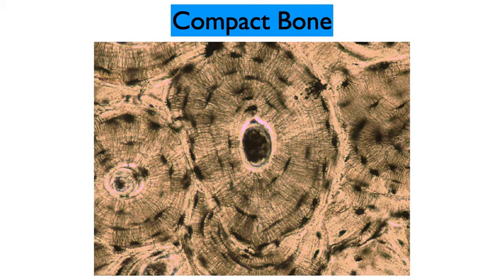And so those osteocytes, they're kind of stranded in those lacunae, and so they are able to communicate with one another, radiating out from the osteocytes. You see the canaliculi, and that's the way that they are going to communicate with one another. So you can tell just the way this thing is set up that it's pretty dense, pretty compact.